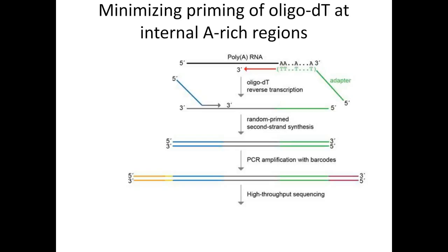Yes, it can. In order to do that, again, you need multiple replicates, and you need to employ some statistical analysis on these replicates. But yes, it can. We didn't need to do that in this study, as I mentioned previously, but it's very effective, and I think the Lexogen website has some software recommended for doing that. That can be done with either the DESeq software, or I even believe there's a new software they have placed on the website.